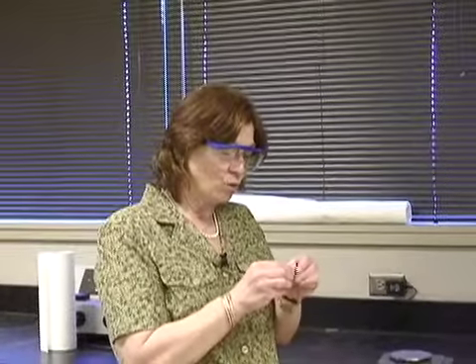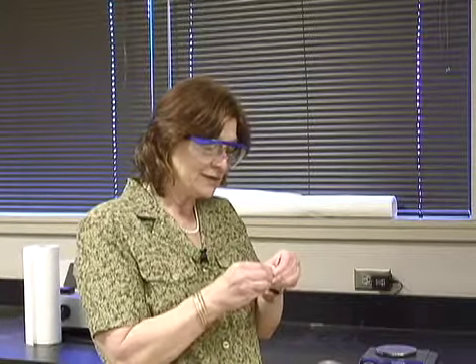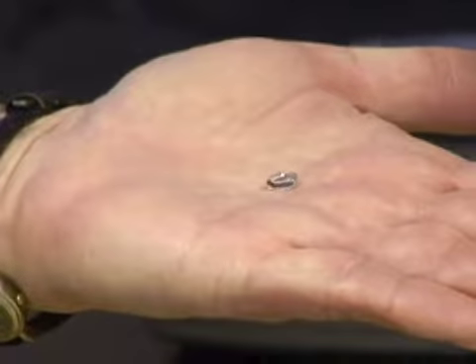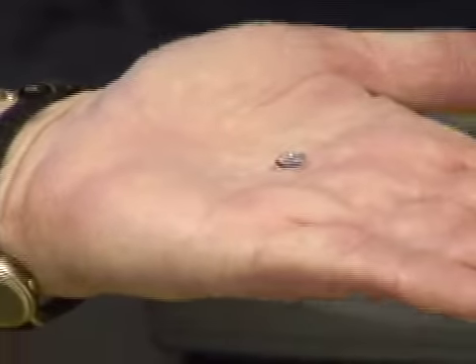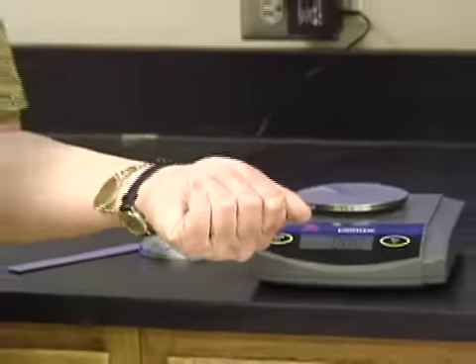Now I'm going to take my magnesium and roll it into a ball. I'm rolling it into a little ball. And now I'm going to take it over to the lab station, and I'll see you there.